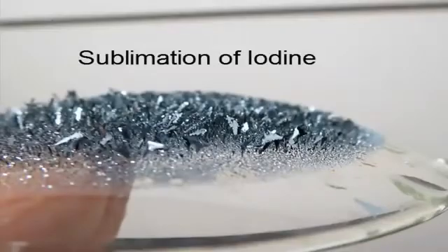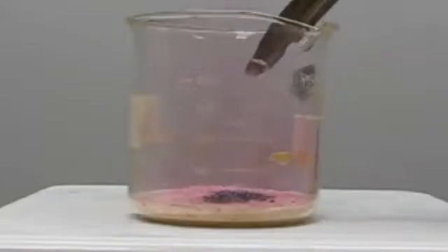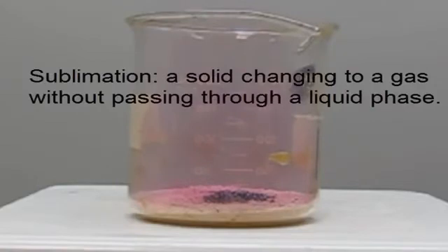In this video, we're going to look at the sublimation of iodine. When we add solid iodine to hot sand — we have a hot plate underneath — you can see right away we start getting a purple gas. That is iodine gas, and with sublimation, we're going directly from a solid to a gas without passing through a liquid phase.